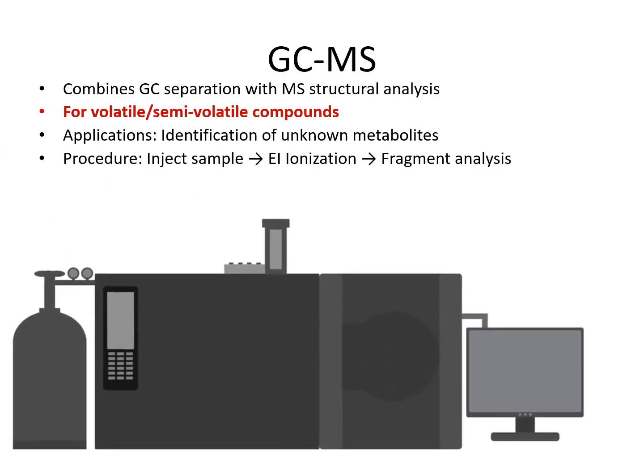Now, the procedure of GCMS is simple and automatic, just like that of HPLC. It involves injection of the samples, ionizing the components of the samples, and then the fragment ions are detected by a detector and sent into a computer where the detected components are visualized.